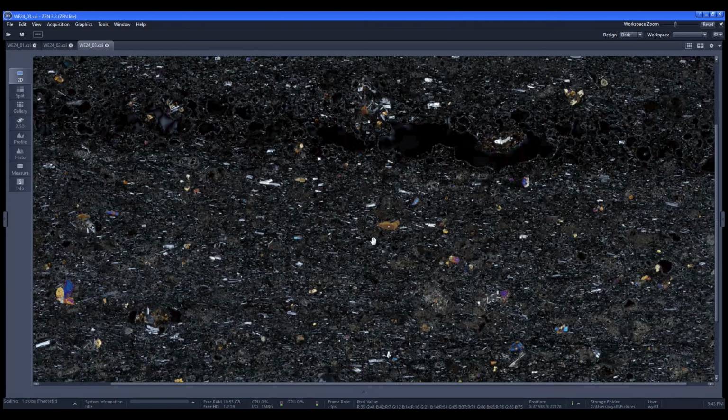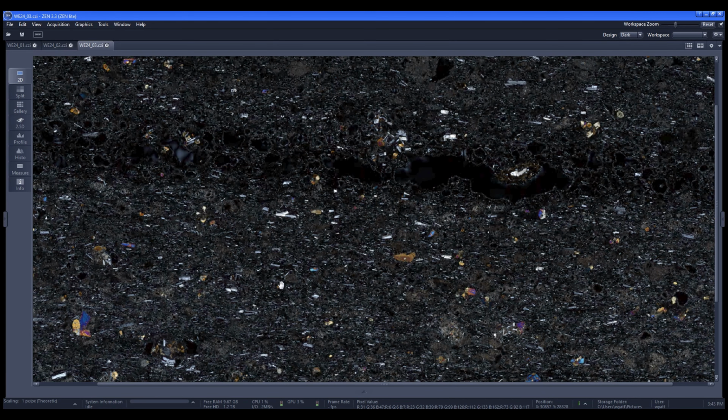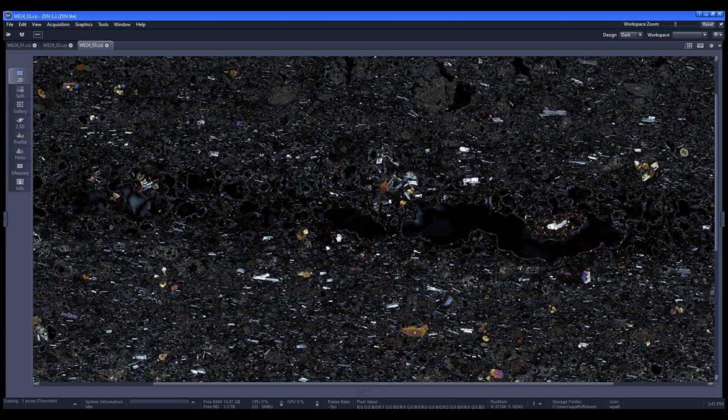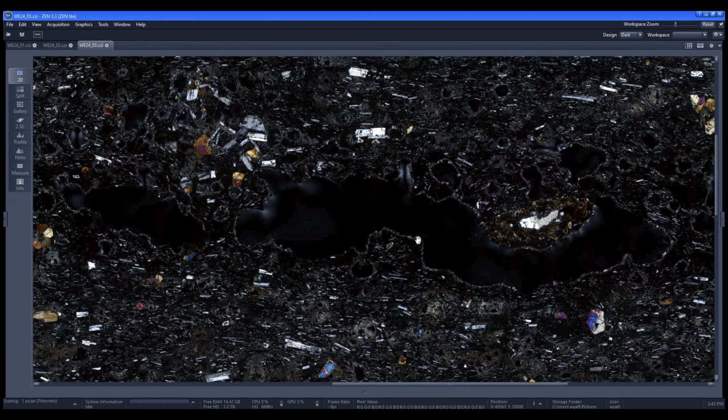So if you have any kind of lava rocks in your flower beds that are red and have tons of holes in them, that's essentially what this is. But this was on a larger scale. The sample I took was a little smaller than a football, but definitely bigger than a softball, somewhere in between. And this type of rock is going to be really gas rich. And you can see there's these big dark holes.